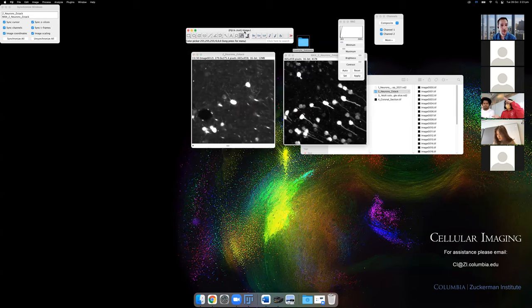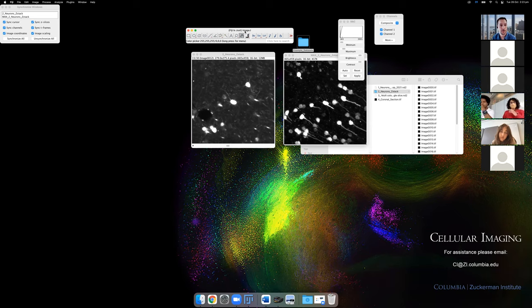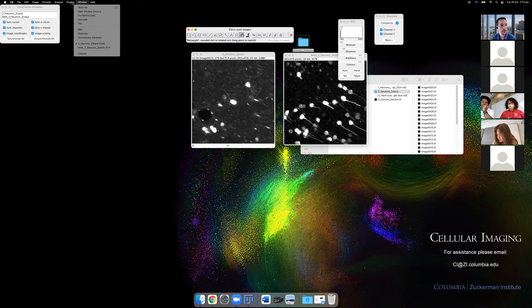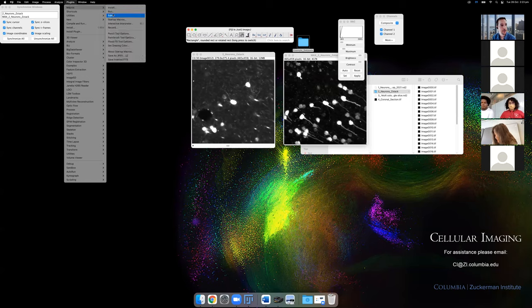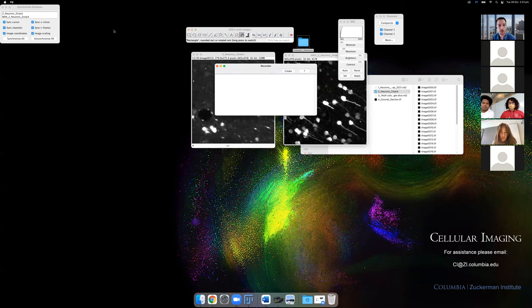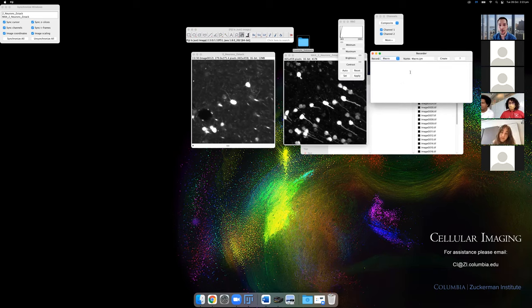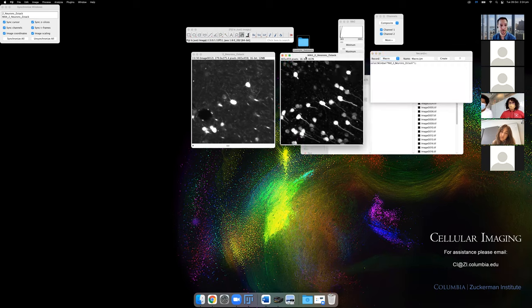If you see staining at the top and bottom of a section but not in the middle, that's a good indication that you either need to optimize the staining or restrict analysis to where staining was reliable. Fiji can actually do much of what commercial tools do, and for setting up a rigorous automated pipeline it can be very powerful. Under Plugins > Macros there's a Recorder — open this so you can see how much of what we're doing is scriptable.